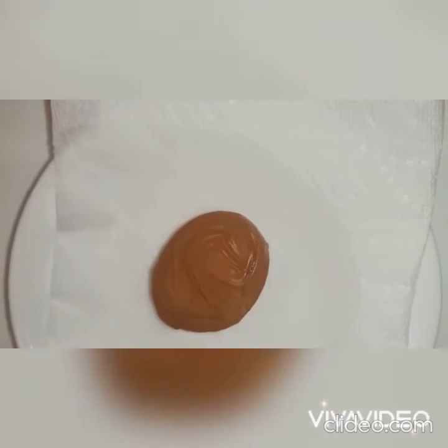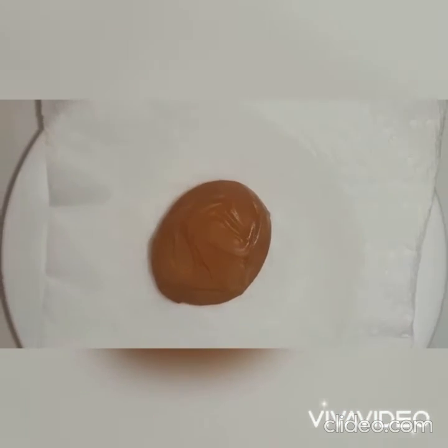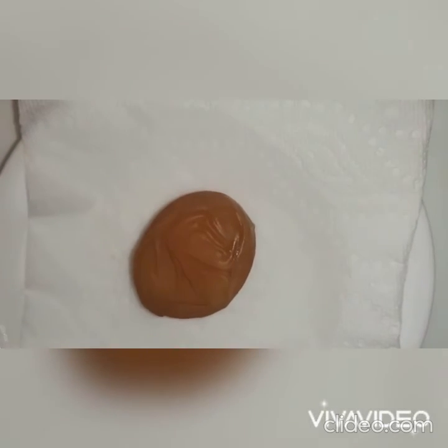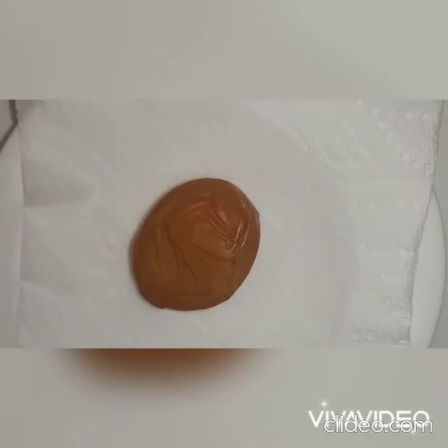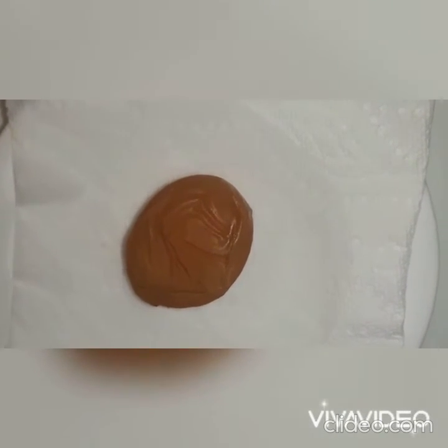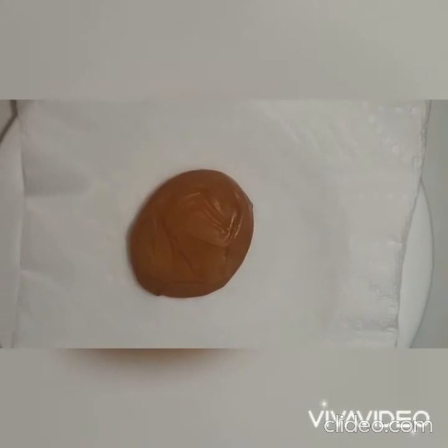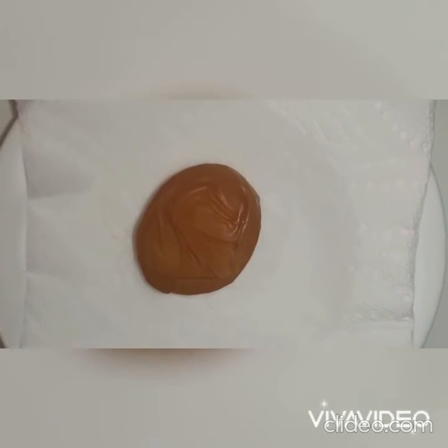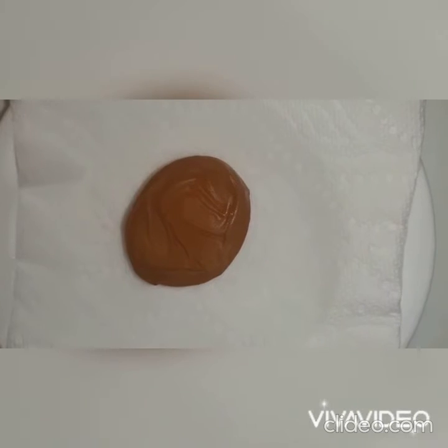When placed in maple syrup, which is almost 70% sugar and only about 30% water, the turgid egg lost its water content by osmosis. Since the egg was first placed in vinegar, it gained a lot of water from the vinegar and became turgid. When this egg was then placed in maple syrup, the water potential inside the egg was higher than the water potential in the maple syrup, depicting a high concentration gradient between the egg and the syrup. This means water moved from the egg into the syrup by osmosis to reach equilibrium.